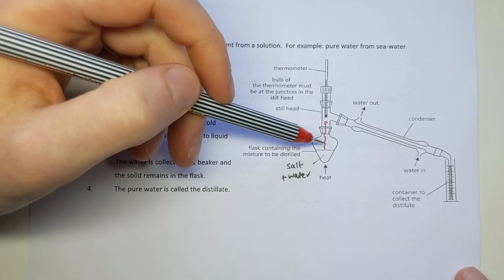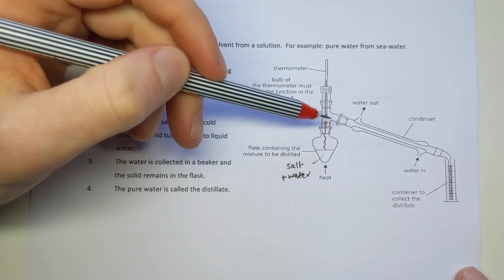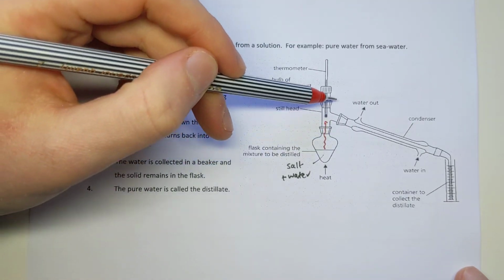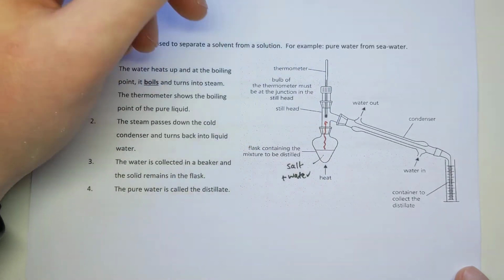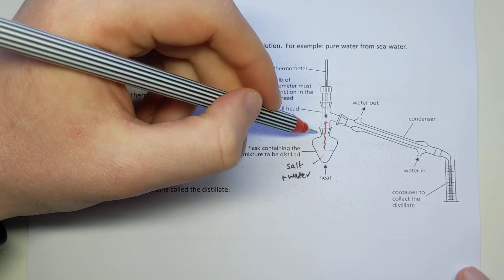My steam has now risen from this container. In normal situations I would just evaporate off into the air, but I've contained this. I've got a still head which connects these pieces together, and it's blocked at the top by this thermometer. We'll come back to the thermometer in a second.